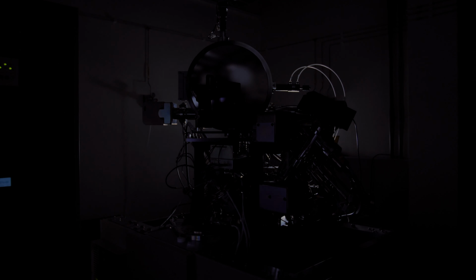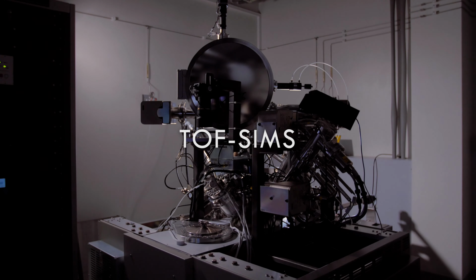Our time-of-flight secondary ion mass spectrometer, ToF-SIMS, is an instrument for chemical or elemental analysis of solid samples. The simplest way to describe SIMS is to picture an electron microscope. Instead of a simple image, the pixel data of SIMS consists of mass spectra, where every pixel holds the data of the chemical representation of the sample.